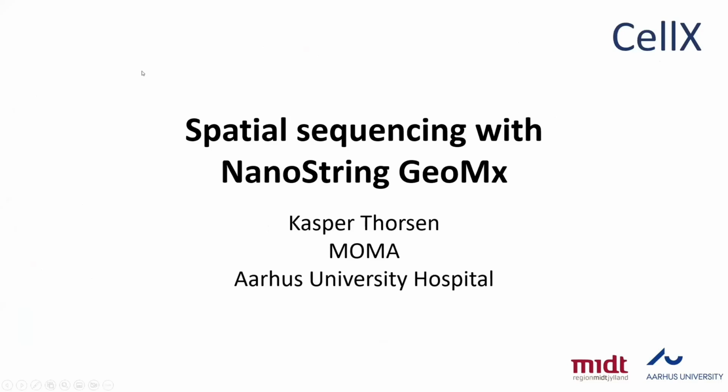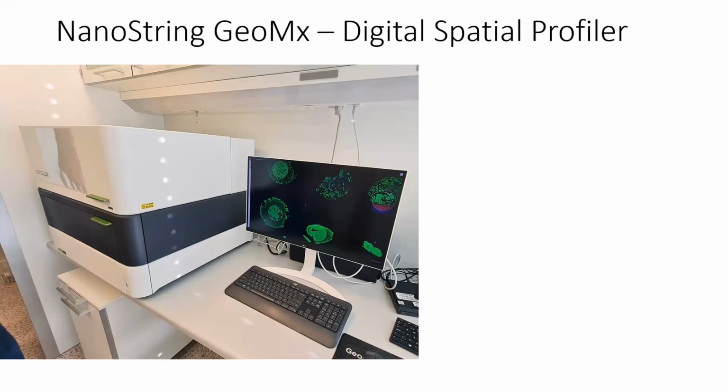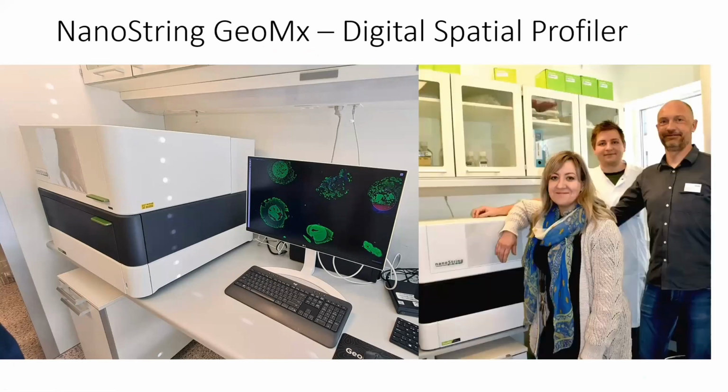I'll be covering spatial sequencing with the nanostring GeoMx. And this is what the nanostring GeoMx actually looks like in the MoMA lab. But of course, the machine doesn't do it alone. So here we have the GeoMx lab team.